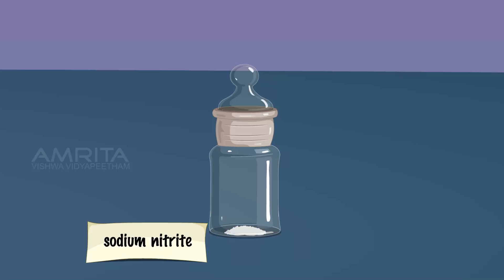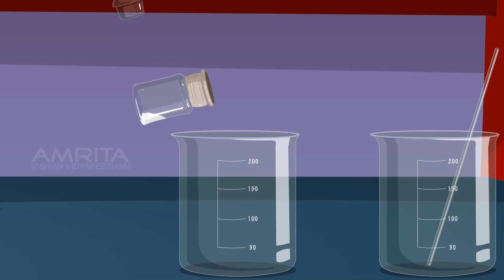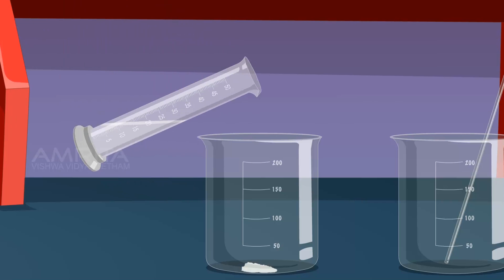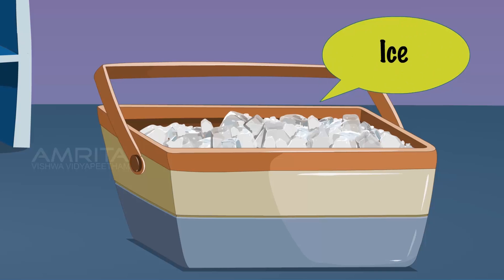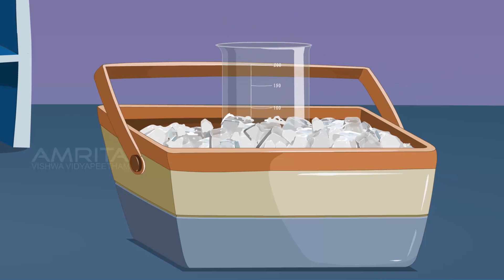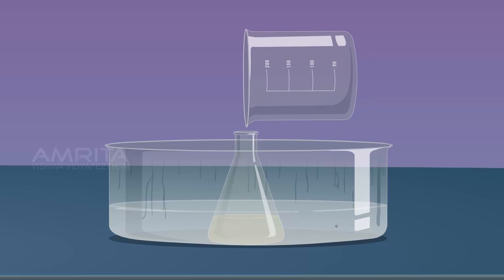Take 4 grams of sodium nitrite and transfer it into a beaker. Add 20 ml of distilled water to it. Stir the contents of the beaker using a glass rod to dissolve the solid. Cool this solution to 5 degrees Celsius by placing the beaker in an ice bath. Now add sodium nitrite solution to the contents of the conical flask.